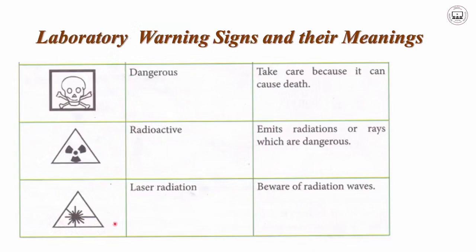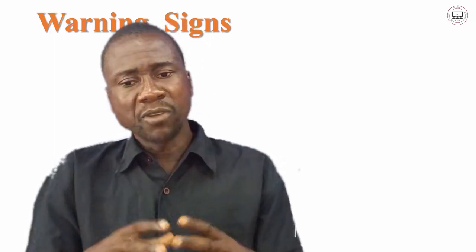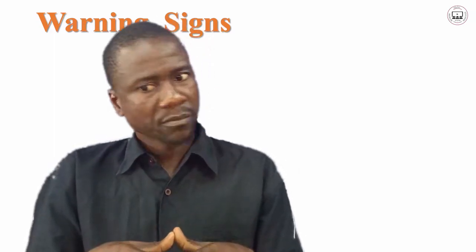Then another type of laboratory symbol is the laser radiation sign. This is a sign for laser radiation. So this is telling you to beware of radiation waves. So those are some of the symbols you might find as you enter the laboratory. And you have known the meanings, which means for now you'll be aware of such symbols.